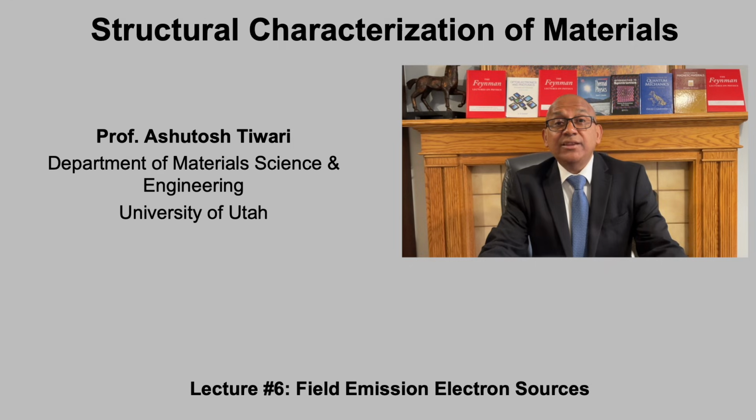By understanding the physical mechanism of field emission in detail, we will see why these sources produce highly coherent, high brightness electron beams, why they require ultra-high vacuum conditions, and why field emission SEMs consistently outperform thermionic sources when high spatial resolution and beam stability are required.